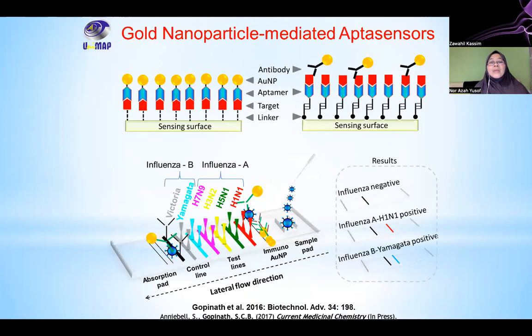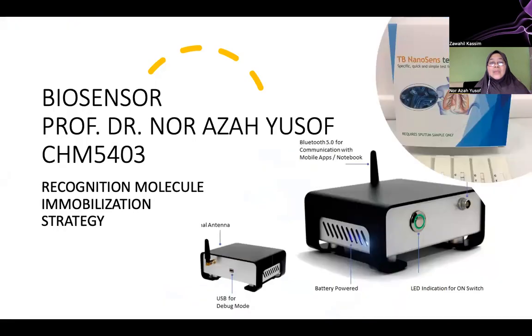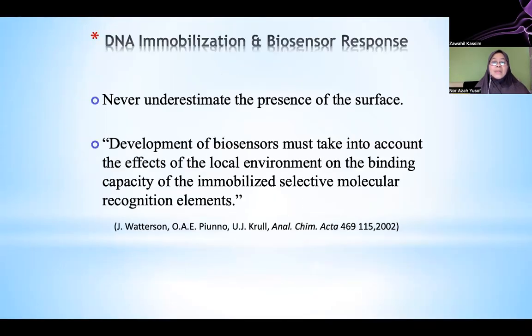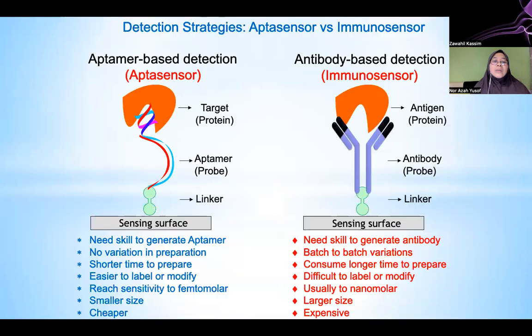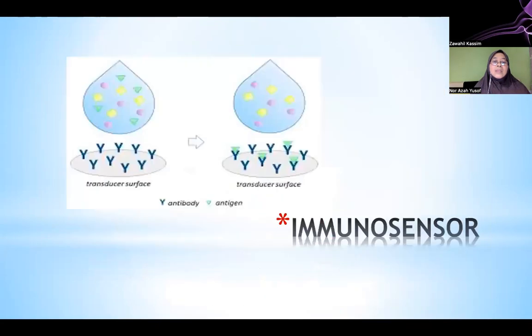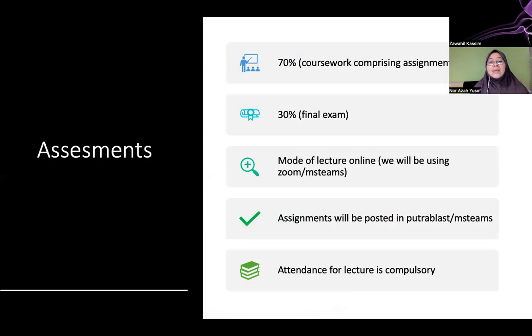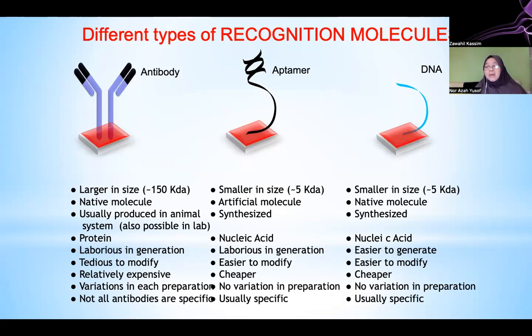So this one is how the sensing is being done by using aptamer. This one we'll reserve for later because we have to discuss something else first. Okay, so those are the three biomarkers that are commonly used. I'm not saying that there are only three, but these are three commonly used in development of biosensors.